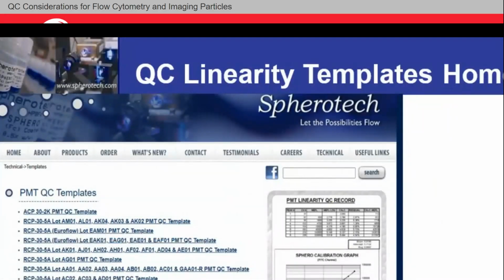This is our templates homepage. There are some great how-to guides underneath, right? This might be a little overwhelming, but as I said, sometimes lots change. There is a lot of conservation. So from AM01, AL01, AK04, AK. For multiple bottling lots, they had the same master lot, but there was a change. AK01 is different from AK02. So if you're using a template, it's always good to check.